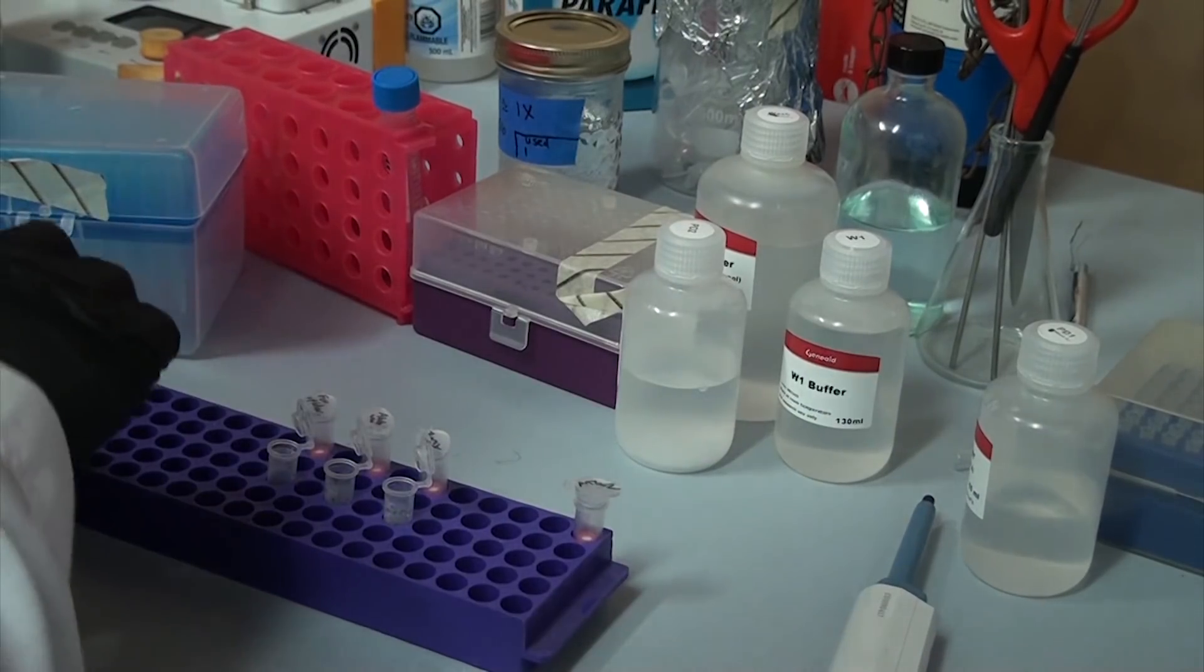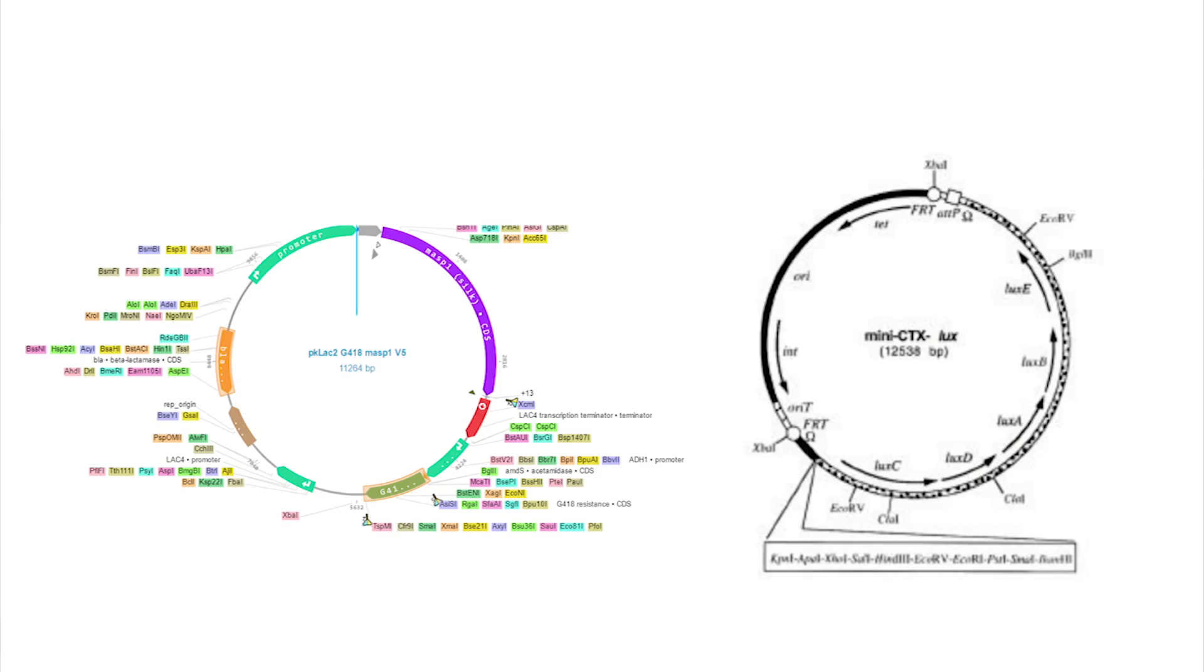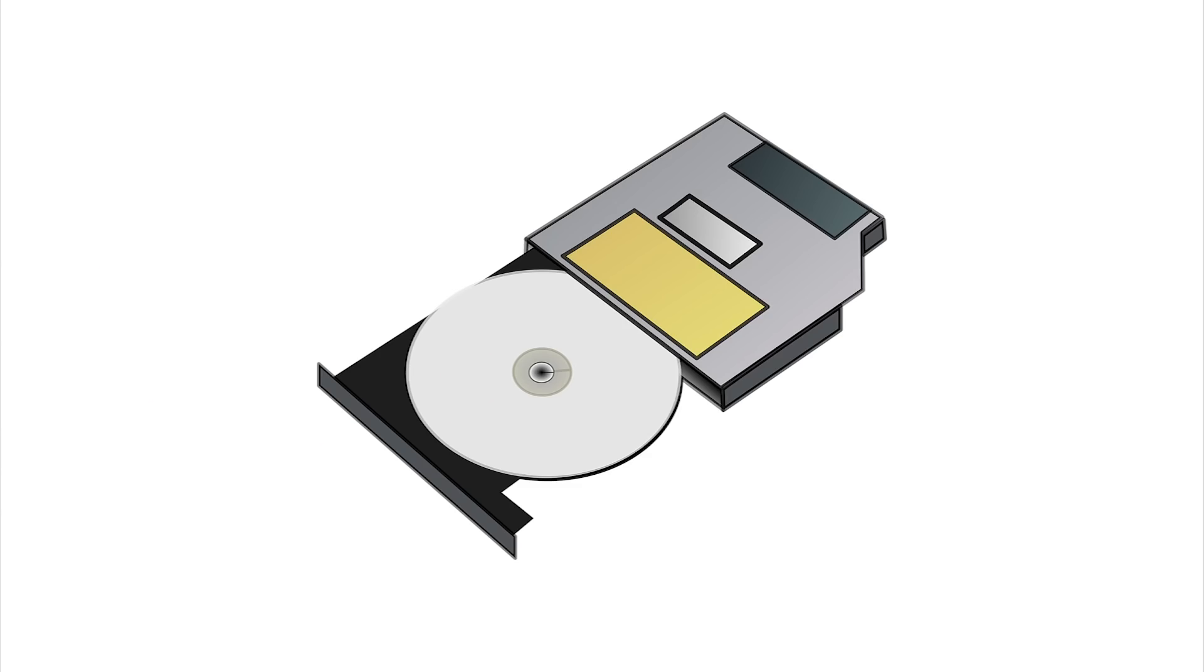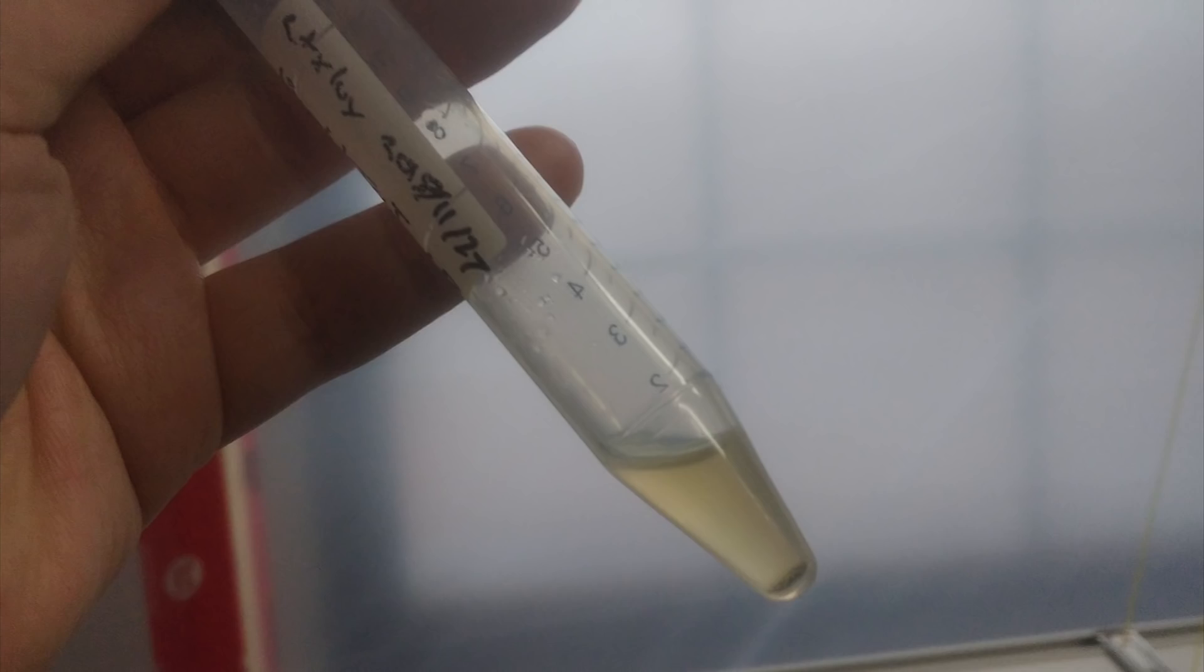Let's start with the bacterial kit. This one is made to isolate plasmids, which are small circles of DNA that we add to bacteria to make them do new things. Sort of like putting a CD into a computer. In this case, I grew some E. coli that have a plasmid in them that makes them bioluminescent, but this should work regardless of what the exact plasmid is. The plasmid uses tetracycline as the selection agent, so I prepared one milliliter of LB broth with 10 micrograms per milliliter of tetracycline, and inoculated it with some bacteria and let it grow overnight.